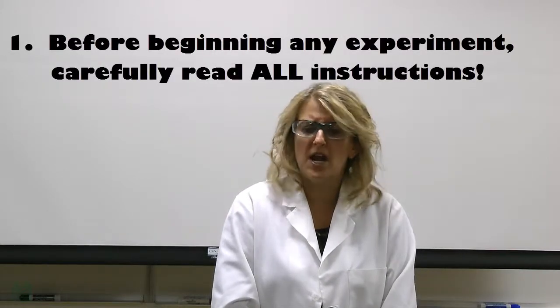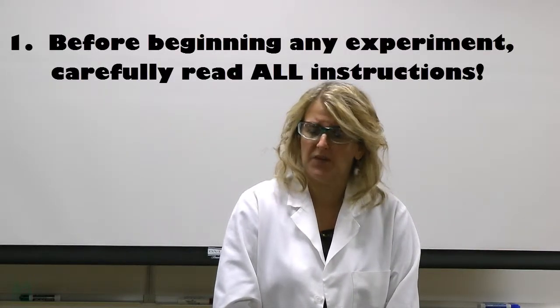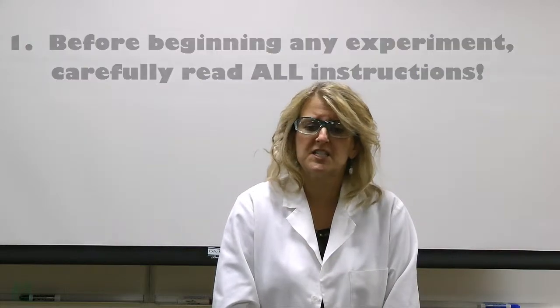I would like to review a few basic safety goals. Number one: before you start an experiment, please read all instructions carefully. For many of the experiments, videos will be provided to demonstrate how to properly execute the lab.